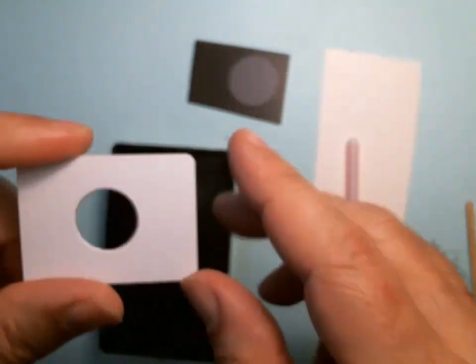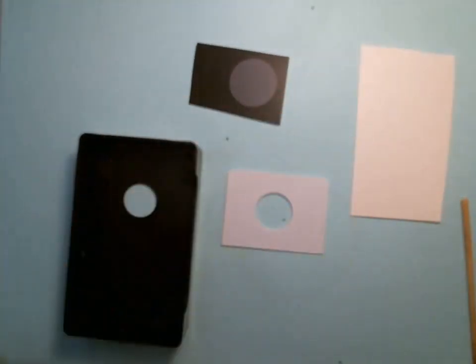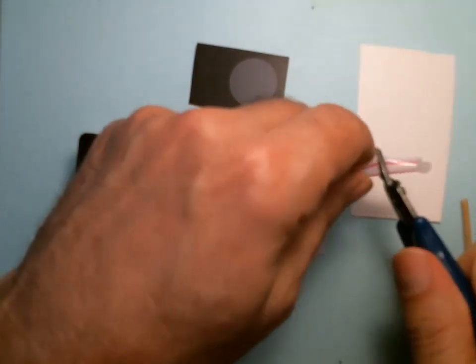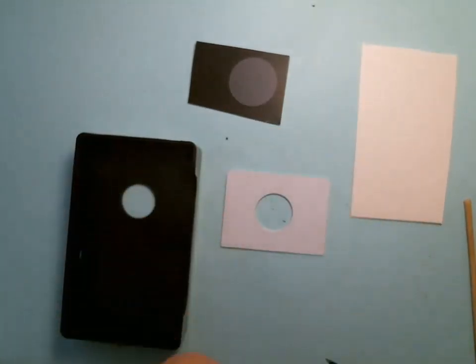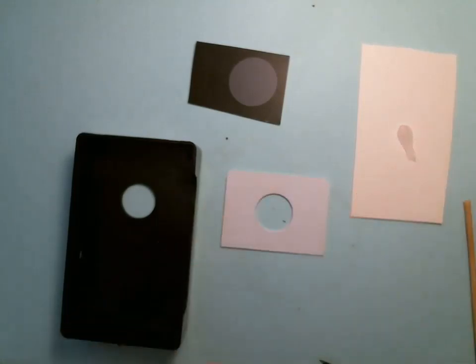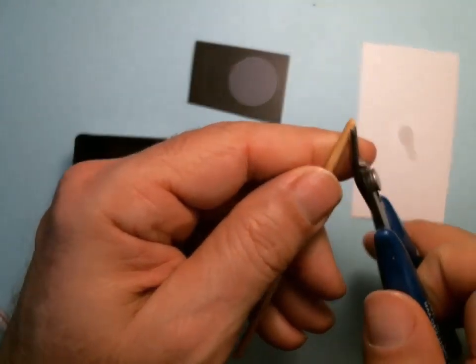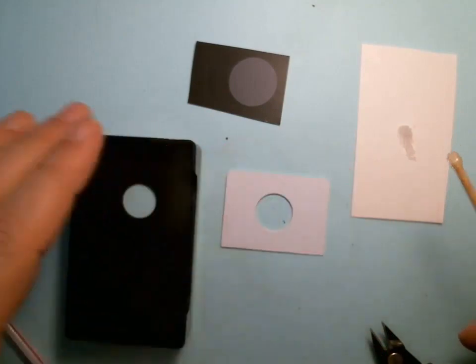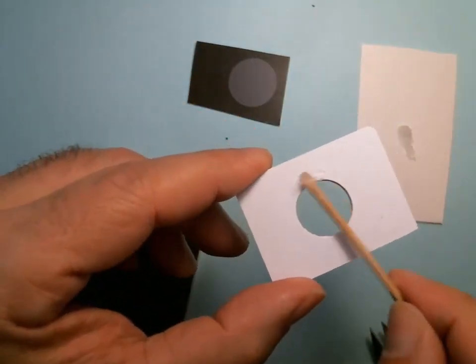We're going to put the glass on it. So I have a little tube of the silicone sealer, so I'm going to cut a fresh bit. Always have a blank piece of paper to get your mess on, and so I'm going to put my silicone sealer on there. I'm going to take my stick. I'm going to make it pointy by cutting a diagonal, and I'm just going to take a little, and just, this is the smooth side, I'm going to put it around the perimeter.